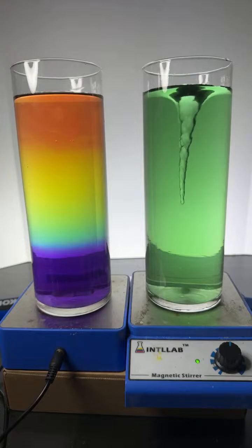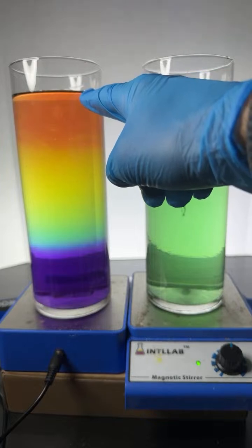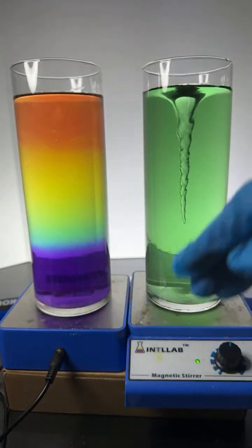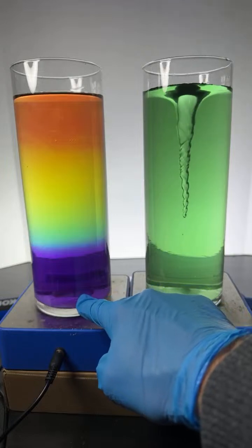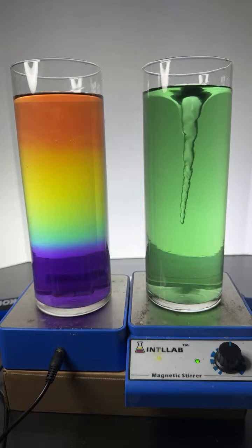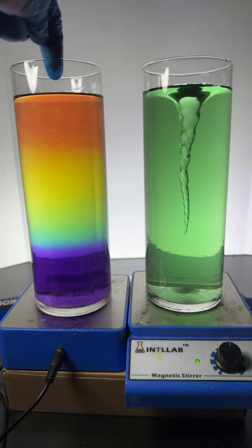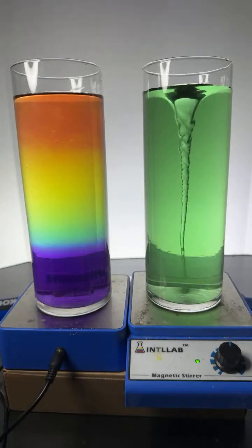There are 10 million times more protons, H plus ions, here at the top than at the bottom. You can also say there's 10 million times more hydroxide ions down at the bottom than there is at the top. All right, put the heart emoji color in the chat that you think this solution will change if I turn on the stir bar.